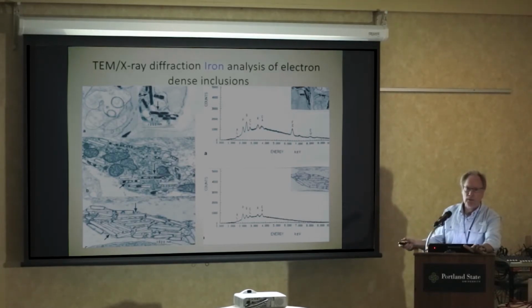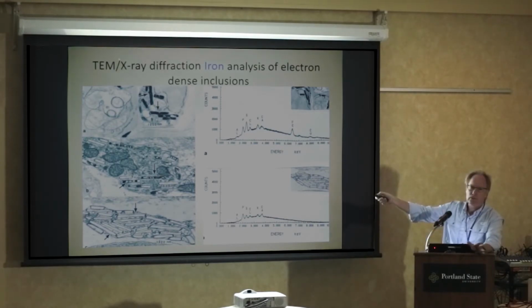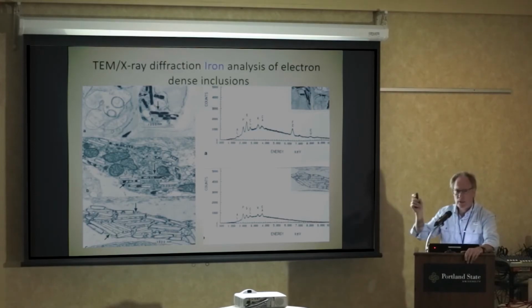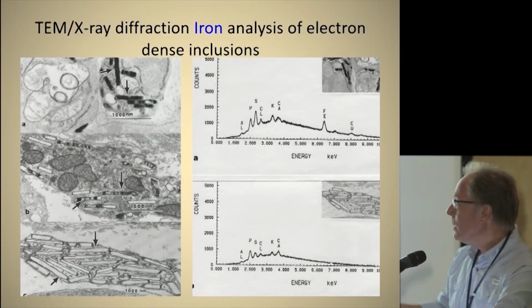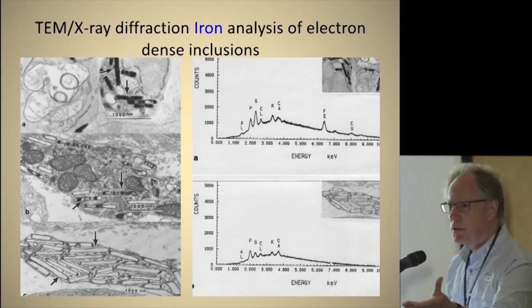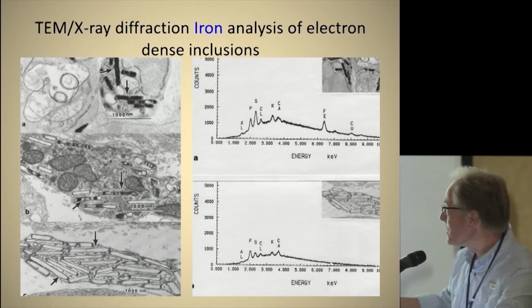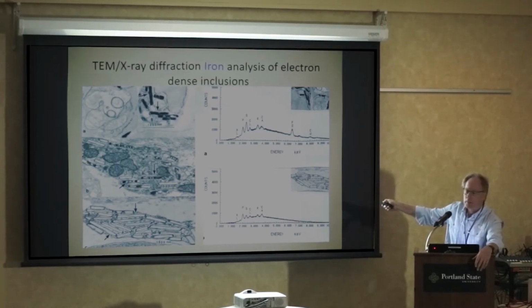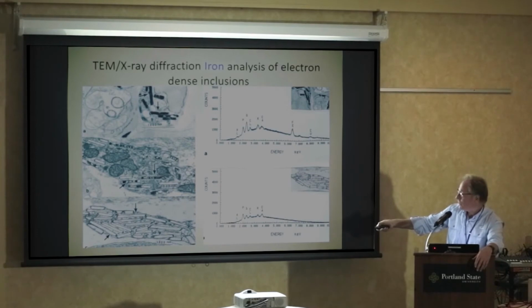But where does the correlative microscopy come in? That's EDAX, or X-ray diffraction, microanalysis. Basically, any element has its own characteristic X-ray curve, emission spectrum. You hit it with an X-ray beam, and boom, it sends up a peak. It doesn't distinguish between valence, between things like ferrous iron and ferric iron, but it does distinguish between iron and everything else. So those inclusions here show a distinctive 6.39 iron peak. That could only be iron, and that backs up the visual data of TEM and Prussian blue with X-ray diffraction. And the same thing down here, those same inclusions, you lose the iron peak.